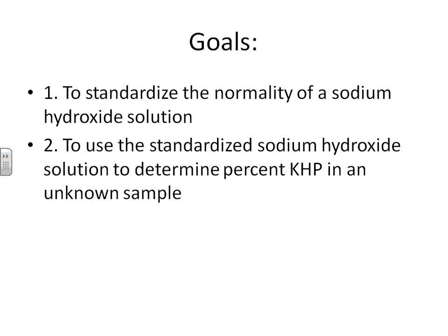So what you're essentially going to do in this first portion is determine the concentration really, really well, so that when we do those additional labs, you will know the concentration really, really well. But we're not finding molarity. We're actually going to be calculating normality. And one of the things I'll be talking about is what normality is and how we can calculate it.